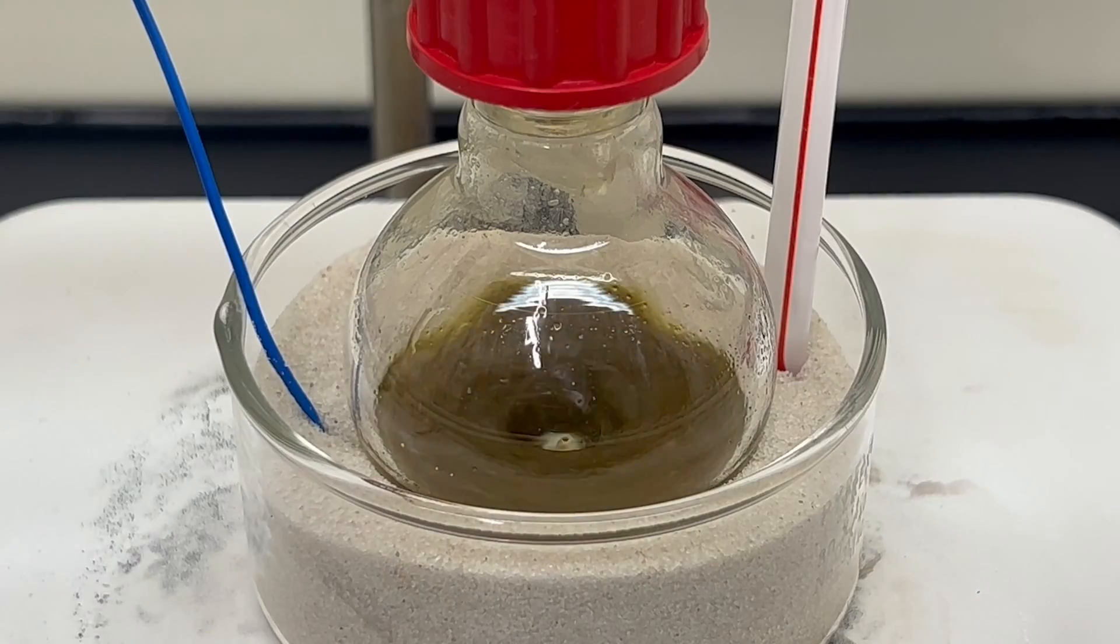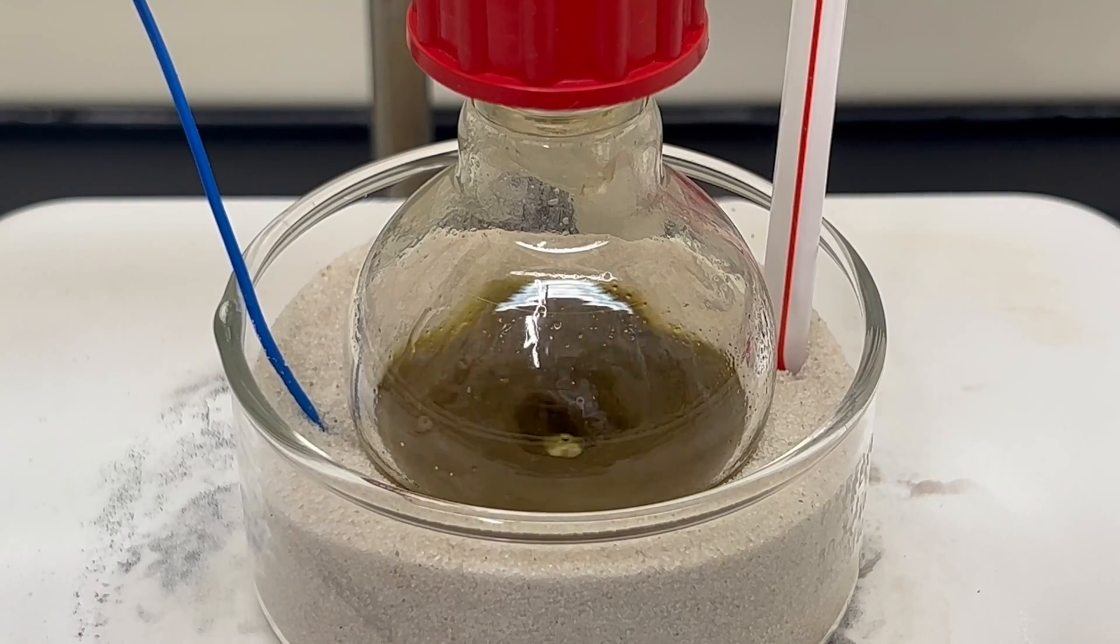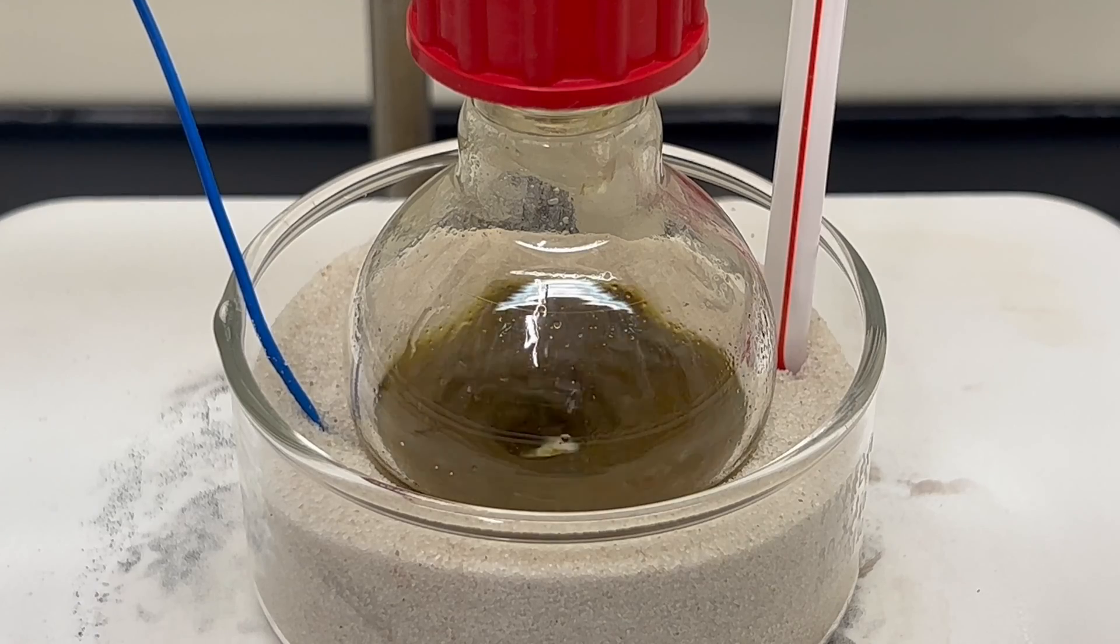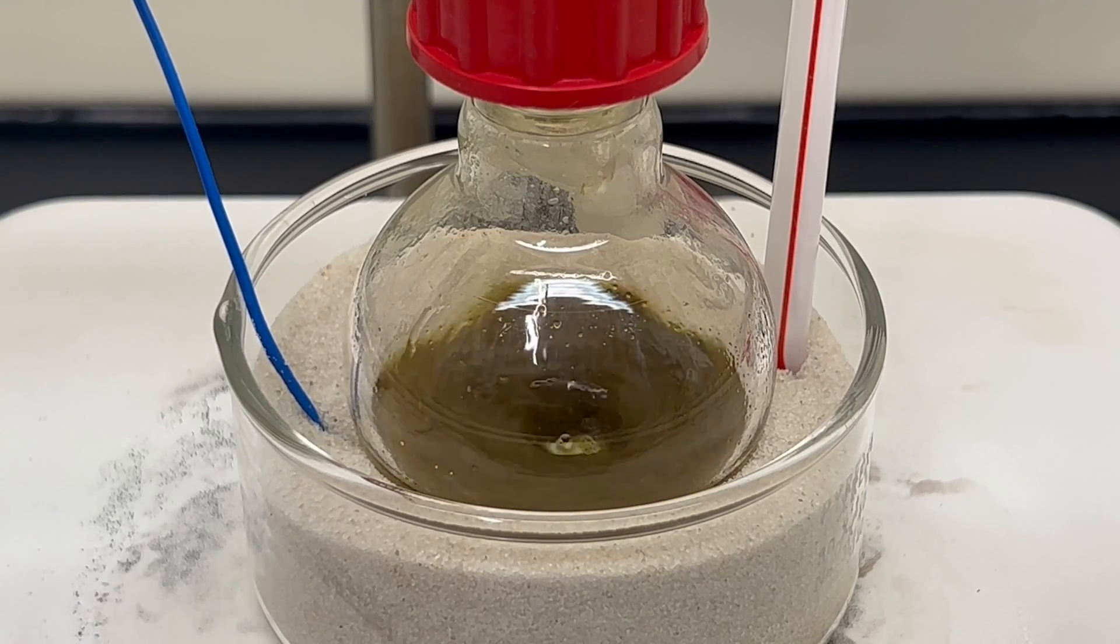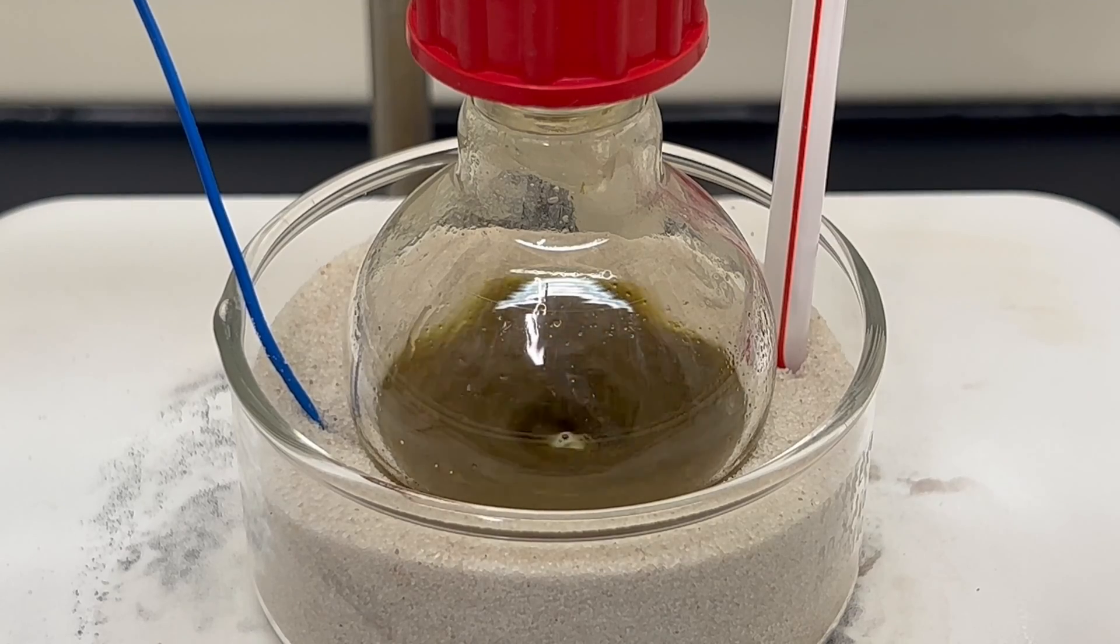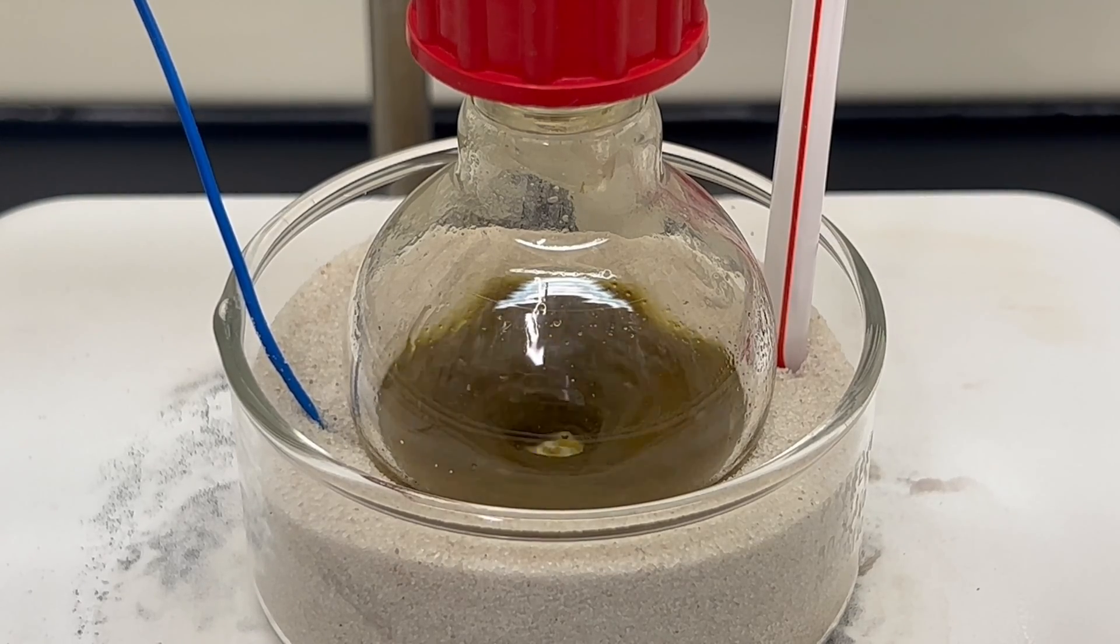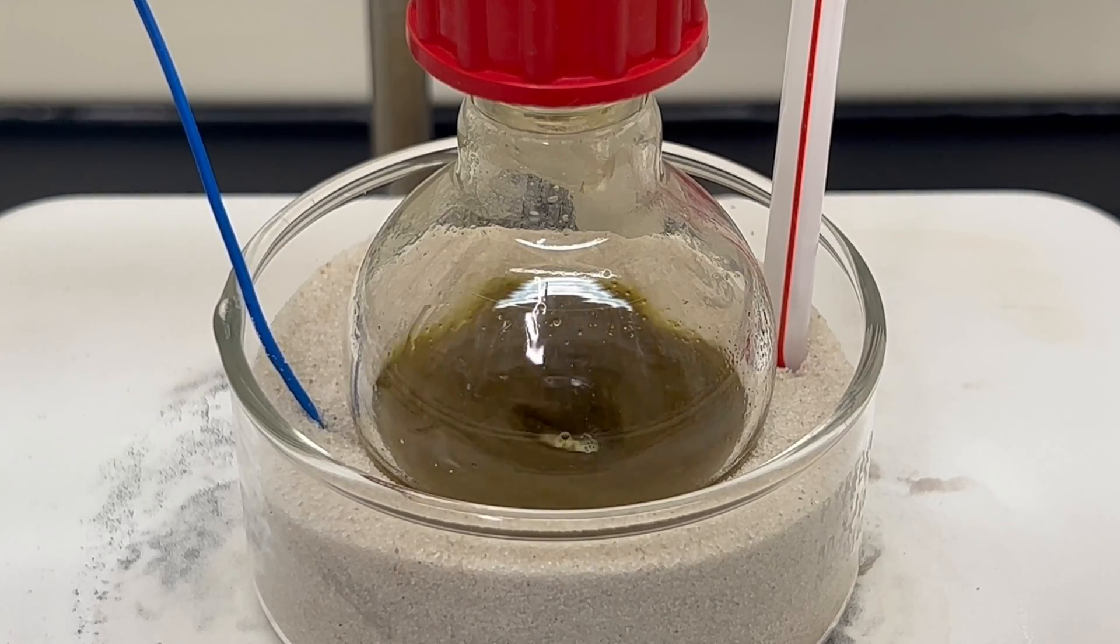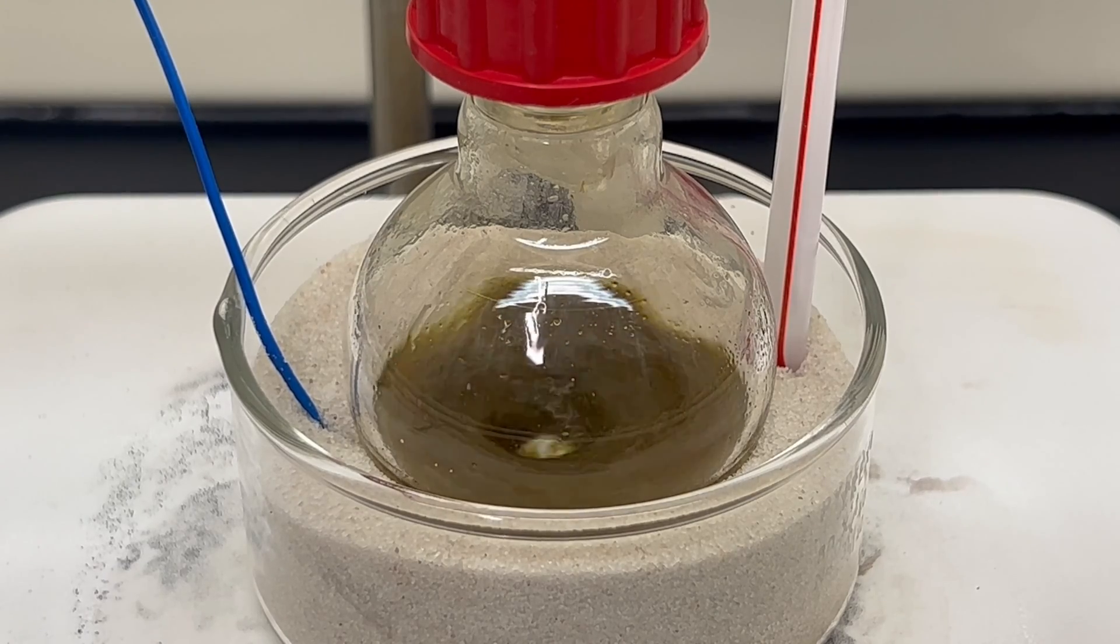The uranium trioxide disappears during this time and is replaced by a green material, the uranium tetrachloride. The reaction between uranium trioxide and hexachloropropene most likely produces hexachloride of uranium which then thermally decomposes forming the desired uranium tetrachloride.